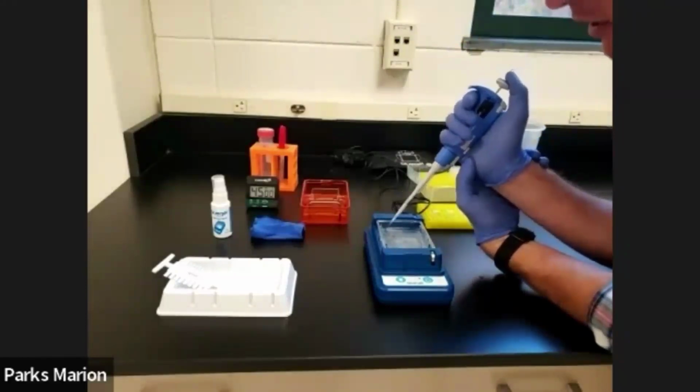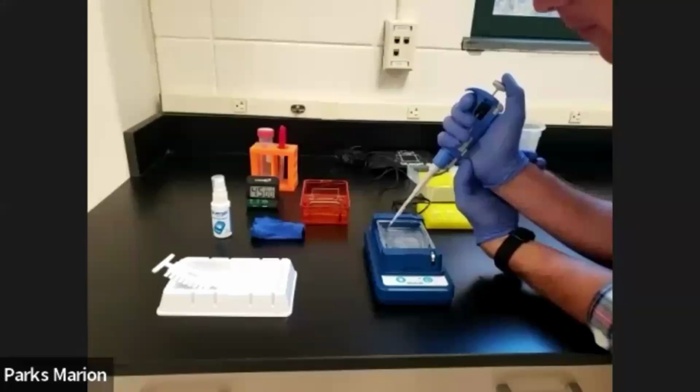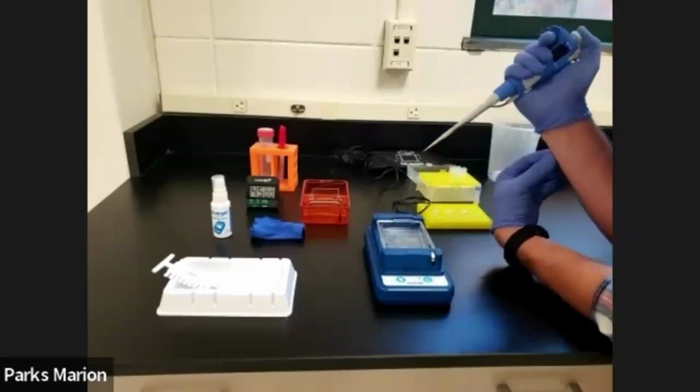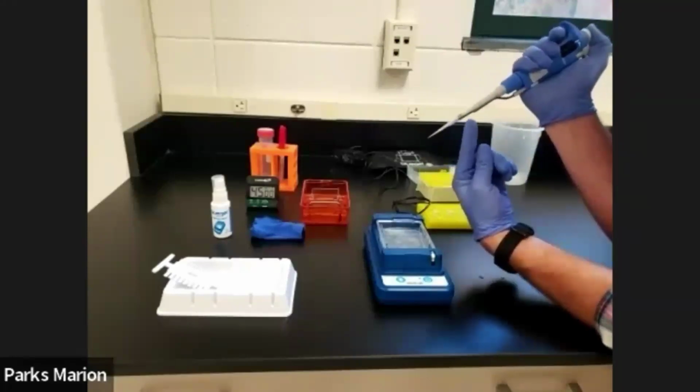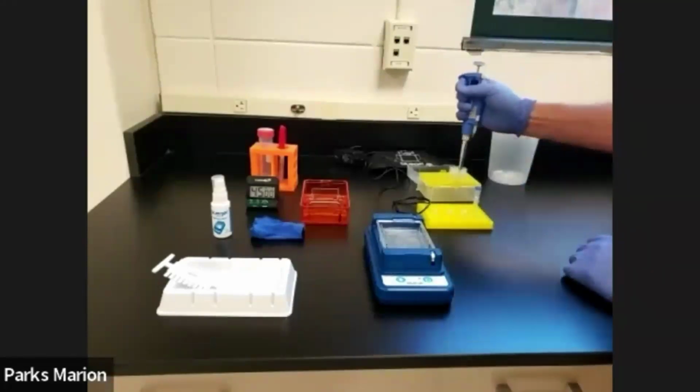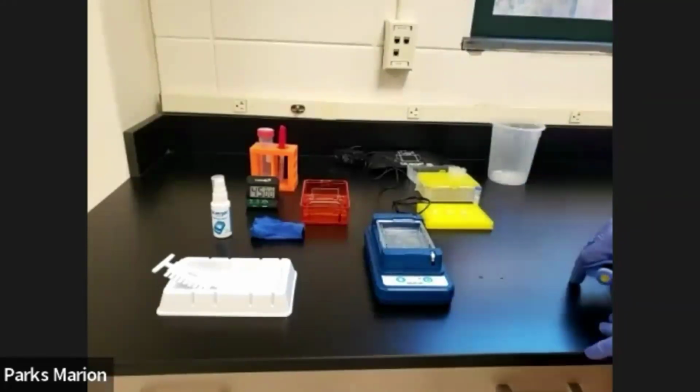Now, you should have practiced this beforehand, but you want to make sure that you are not puncturing the well, puncturing the gel, and that you're not introducing any bubbles. You want to dispense very slowly. And don't release the plunger until you've removed the pipette tip from the solution. Then you can discard that tip and move on to your next solution.